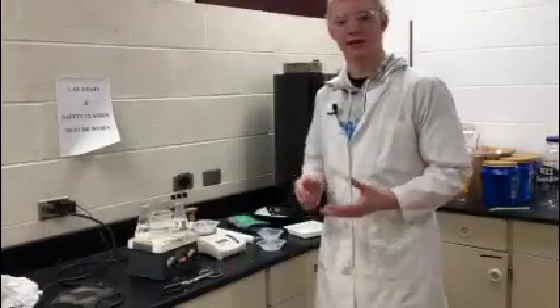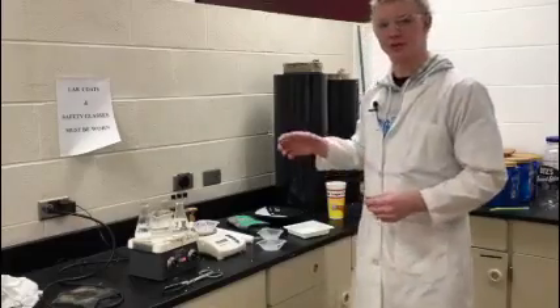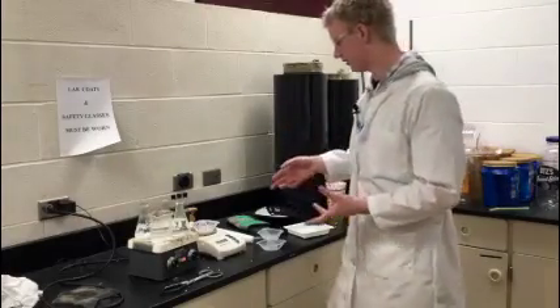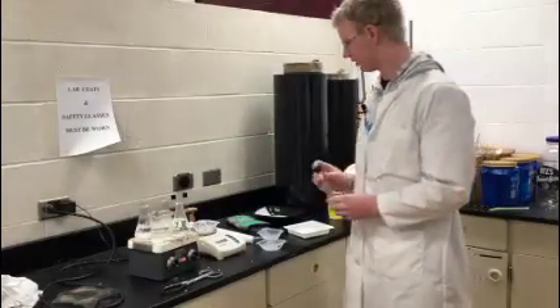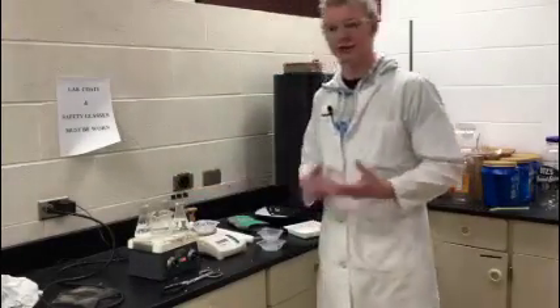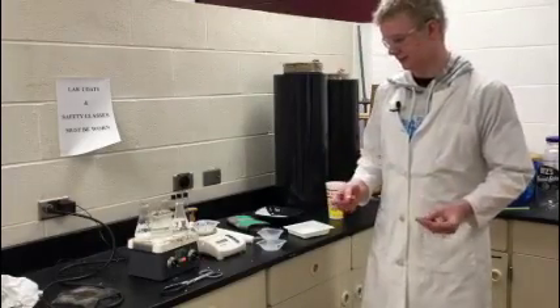As your water is boiling for an hour, you can go to your room temperature water, which you will put in test tubes. Like the boiling water, you will have three samples that are 12 grams each.